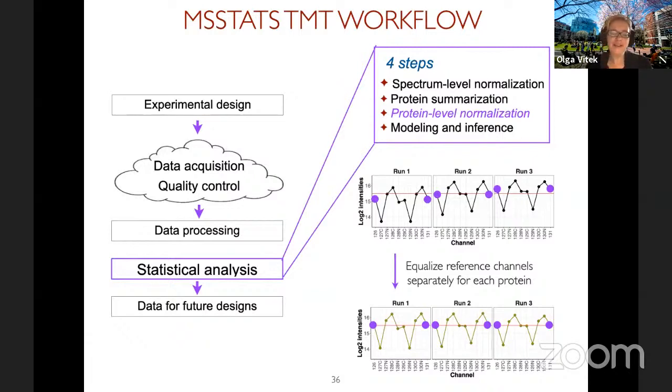If you have an experiment with two conditions and you have 5 replicates per condition, and you can fit everything into one run and just do one run and you are done, then you do not need a reference channel. And this is a possibility. Of course, it also means that you are limited to a very small number of replicates, and also if something goes wrong with your run, that's the end of it, right?